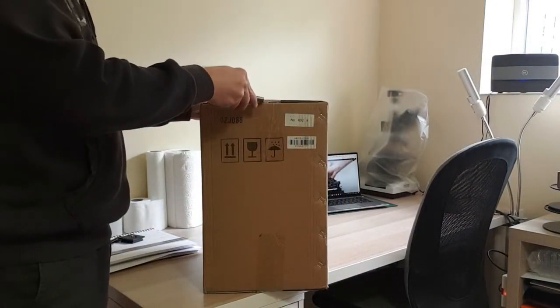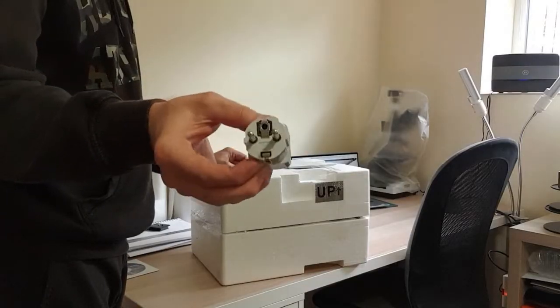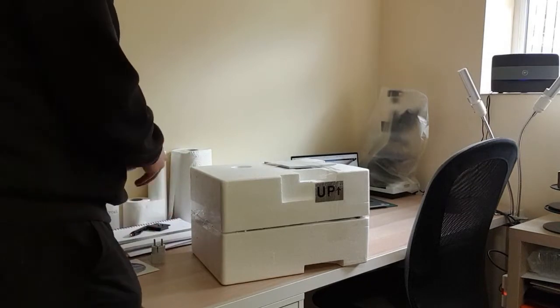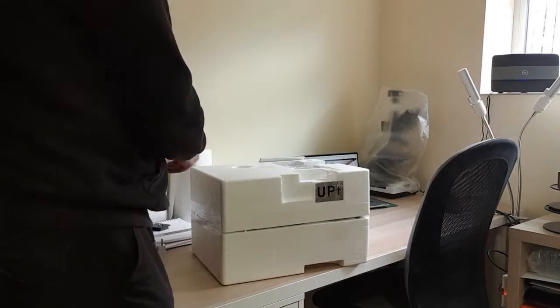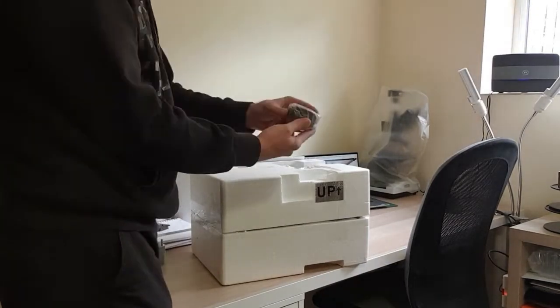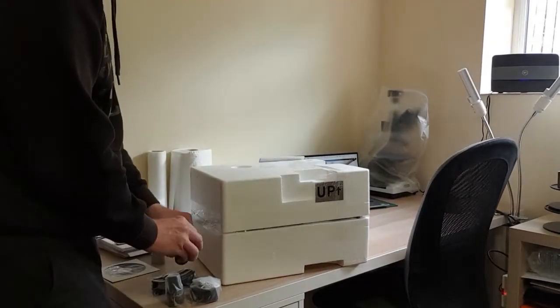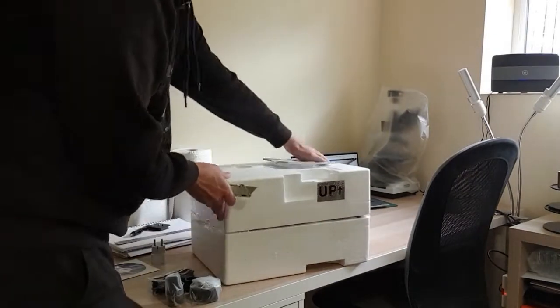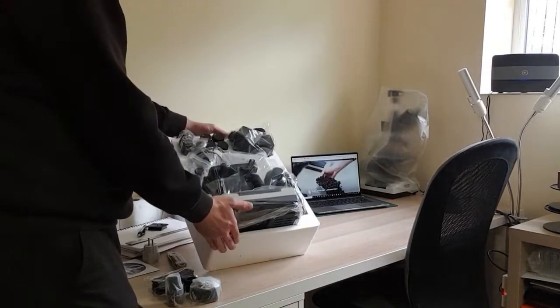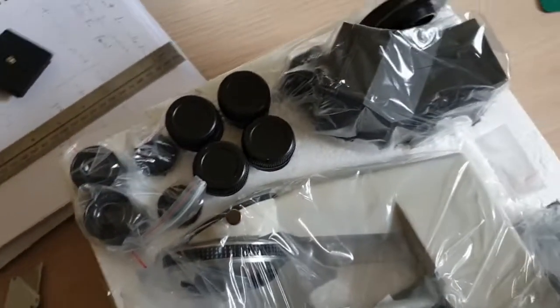The microscope comes in a plain cardboard box nested in a typical styrofoam shell. Before we open that there is a small compartment hiding the camera. You may also find an adapter for use with European style sockets; the UK cable is included as standard. The shell is conveniently labelled with direction arrows. You can use a knife to slice through the tape but be careful how deep you run it. Once open all elements are clearly laid out, with one or two getting loose in transport but not damaged. All in all the packaging does a very good job getting it from the manufacturer.